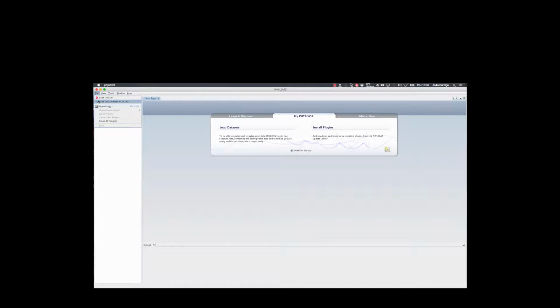Greetings. This is a small example of how to load large datasets such as the Streptococcus pneumoniae MLST dataset on PHYLOViZ 2.0. One of the nice features of PHYLOViZ is you can actually download the full databases for MLST schemas directly from the databases they are providing.